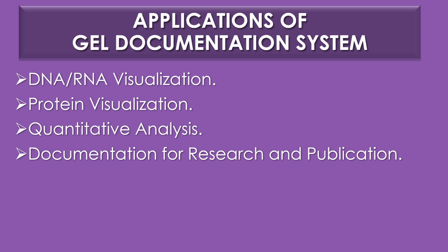The system can quantify the intensity of the bands, which allows for the measurement of the concentration of biomolecules in each sample. This is useful in applications such as gene expression studies and protein quantification. The fourth and final application is documentation for research and publication. Gel doc systems provide high quality images that can be included in research papers, presentations and lab reports.